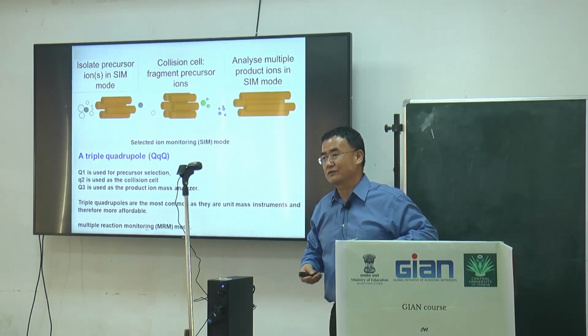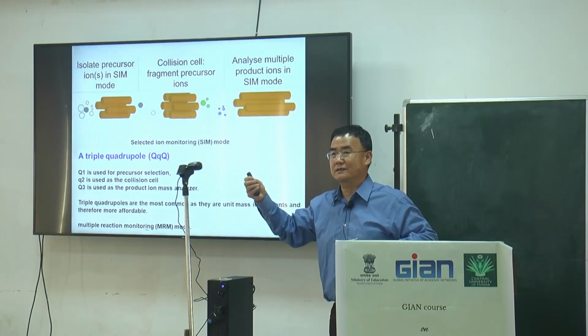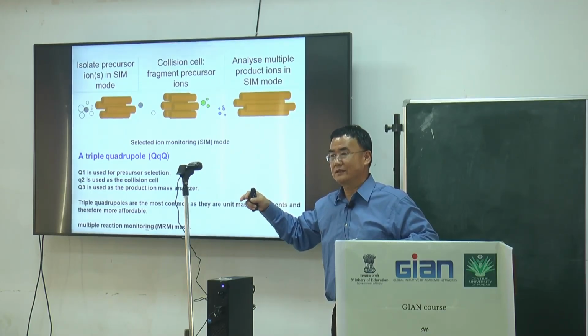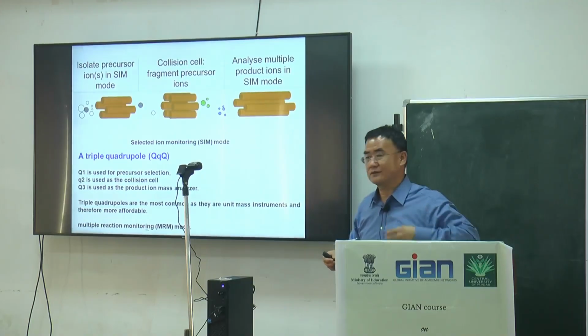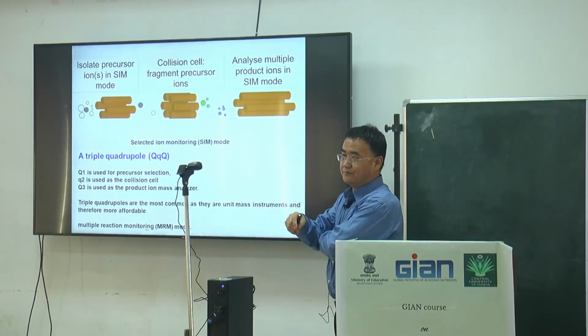Then we compare with the internal standard. For example, for those phospholipids, we have the internal standards. We can buy the pure chemicals: phosphatidylcholine, phosphatidylinositol, PIP, PS, or others like PA, phosphatidic acid. We can purchase most of those.